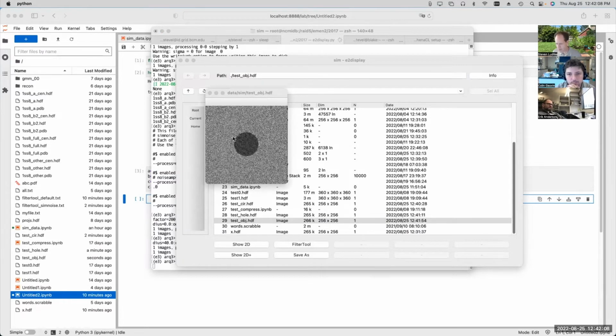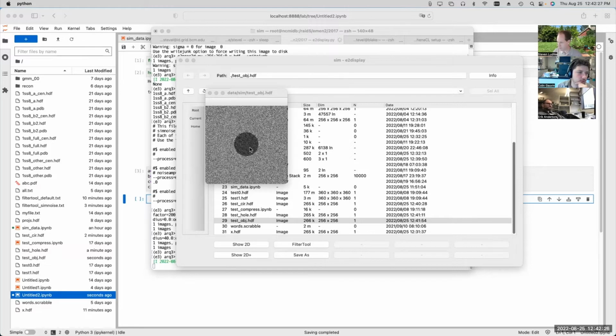Okay, so you can see we had a little bit of a mismatch in how strong the noise was. When I applied the CTF to the noise, I reduced the total amount of power that was present in the noise image. If you integrate under the power spectrum of the flat band random noise, you get a big number because it's flat. And if you integrate under the CTF modified curve, it's massively lower, probably a factor of 2 or something like that.